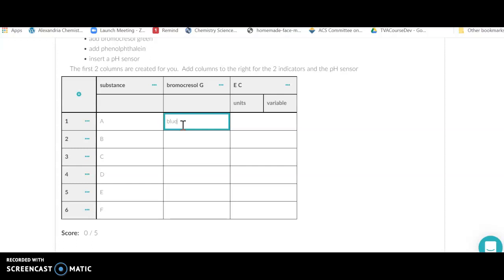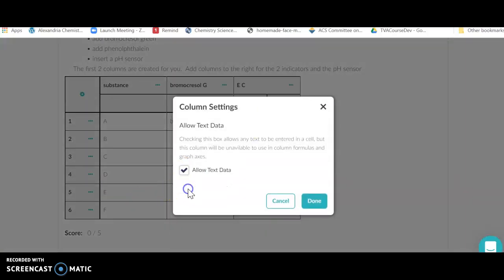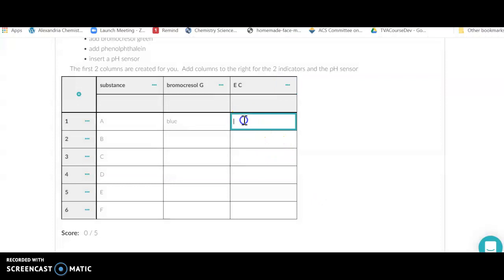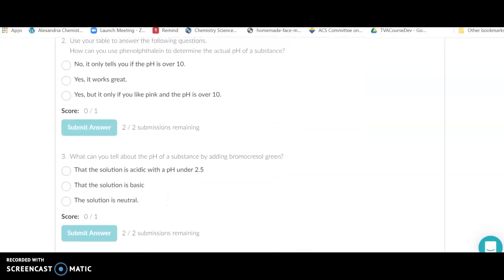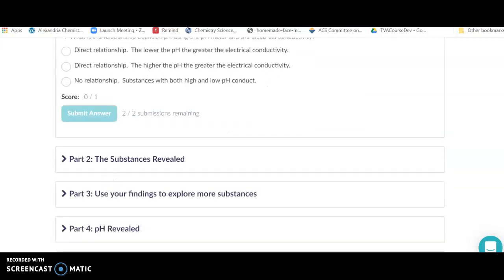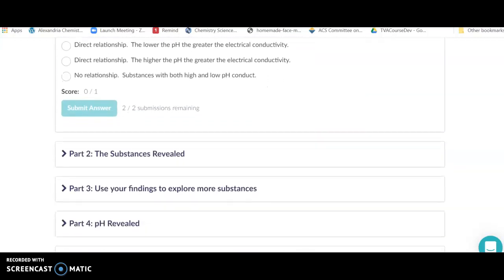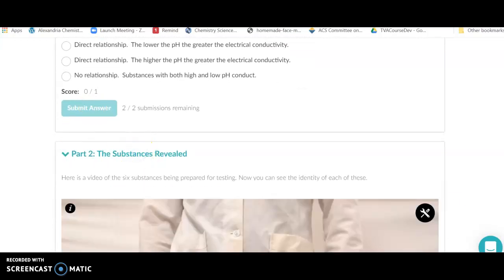Once you have done that, you don't just have to use numbers. You can put words in here, so I can put blue and continue going down. If I get to the electrical conductivity and I want to say that I have yes or no, I can put text as well as numbers here in these columns. When you need more columns, just continue to add columns to the right.